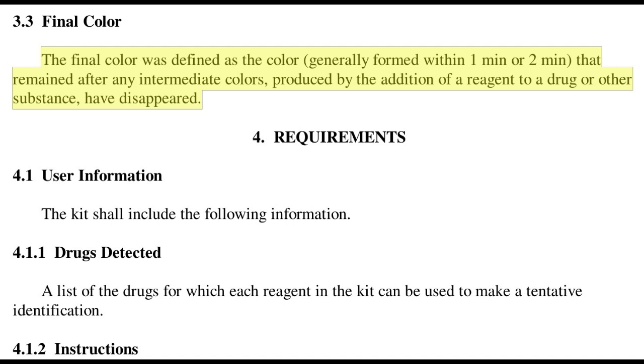If more than 1 color is involved, then the rate at which 1 color changes to another will be temperature dependent. Remember, the rate of a chemical reaction roughly doubles for every 10 degrees C increase in temperature. So a test done at higher temps may change colors more quickly than it will at lower temps. That's why doing these things in the correct temperature range is important, kids.